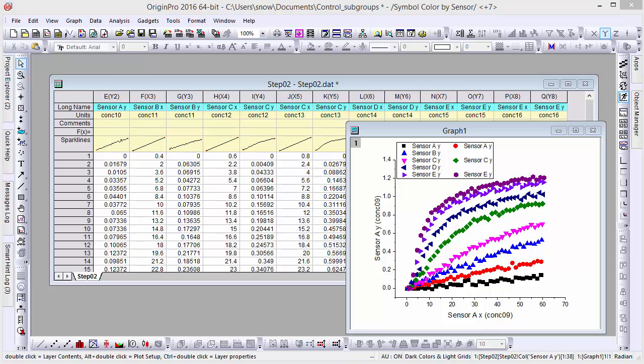In Origin 2015, you could only divide grouped plots into subgroups by their relative size, presenting significant problems for unbalanced data. By contrast, in Origin 2016, you can specify subgroups of a plot by their column label rows.